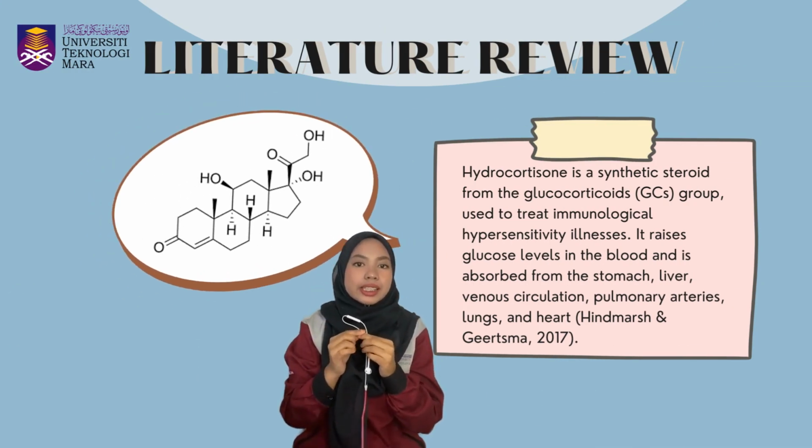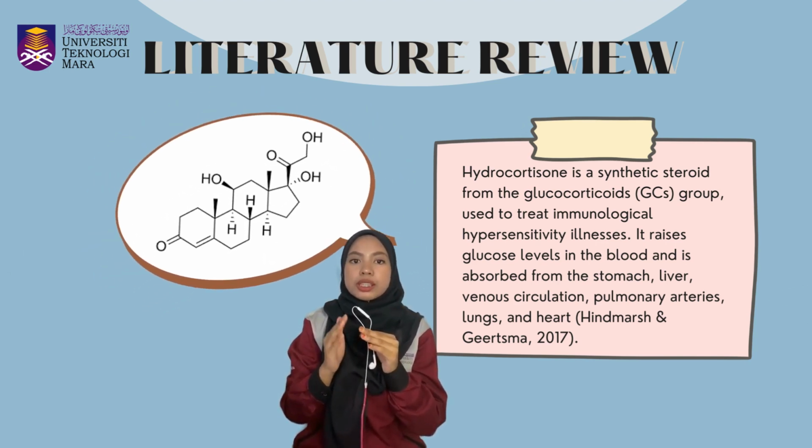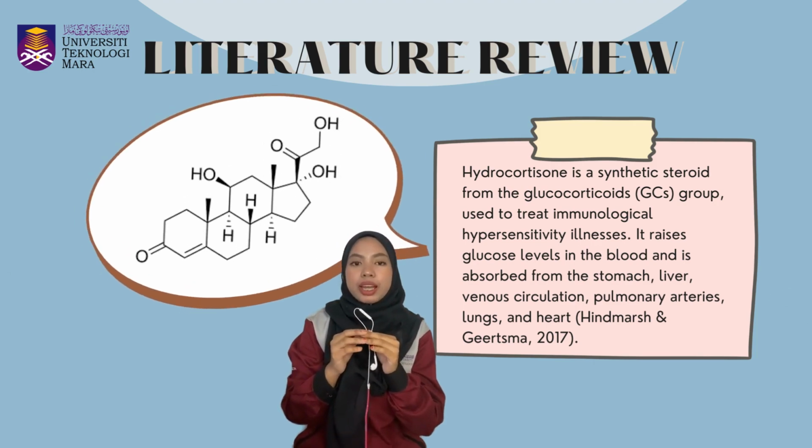Hydrocortisone is a synthetic steroid from the glucocorticoid group. Exposure to this steroid may endanger humans and aquatic creatures.